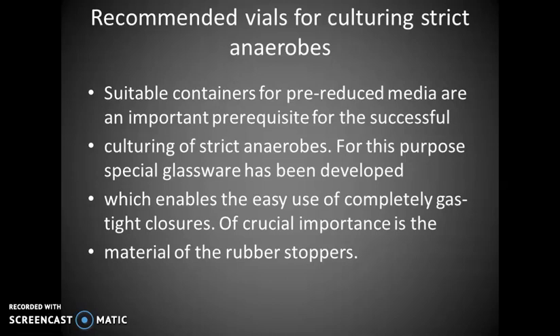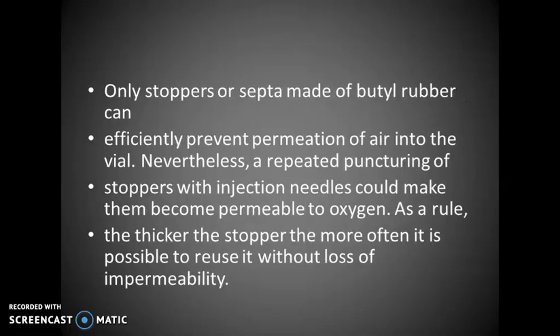Of crucial importance is the material of the rubber stoppers. Only stoppers or septa made of butyl rubber can effectively prevent the permeation of air into the vial.